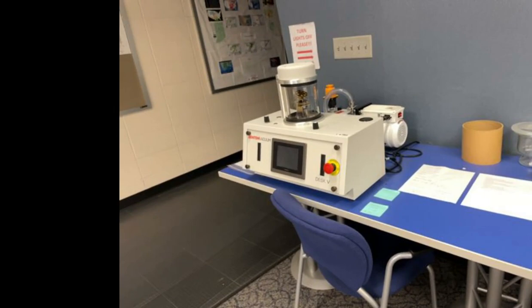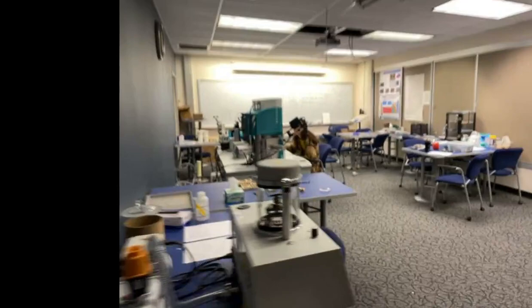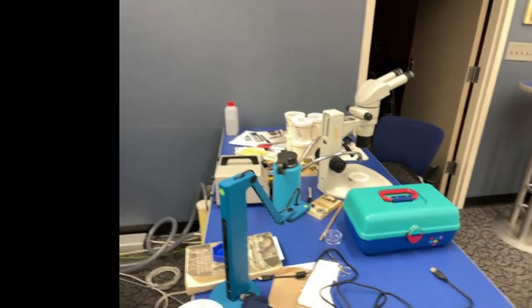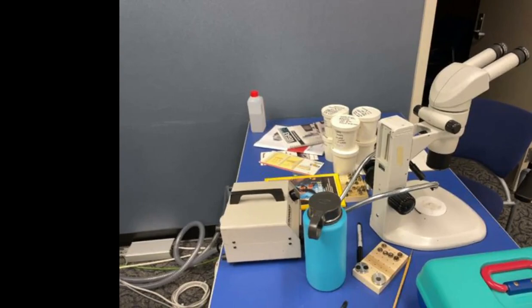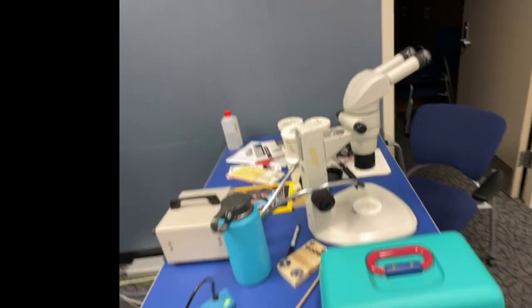So now you have a good idea of the whole lab. It's a really big room. That's the whole SEM lab, and over here I have a little stereo microscope that we use to prep samples sometimes, and also when I change the filament I have to be able to center it, so I use that to center it. And around the corner is a nitrogen tank that we use to pump air into the chamber.